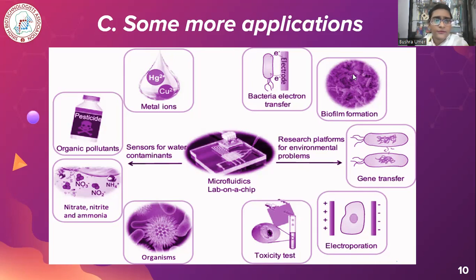Biofilm formation occurs when bacteria face some unfavorable conditions. So it is an alternative life form. By using microfluidic technology, we can also learn and study how certain bacteria, and under what pressure, bacteria are forming the biofilms.